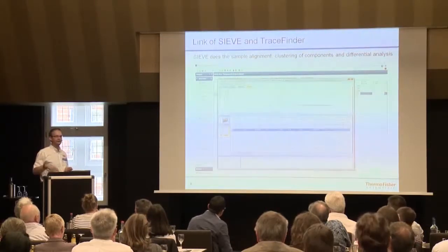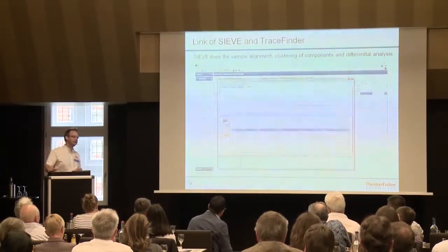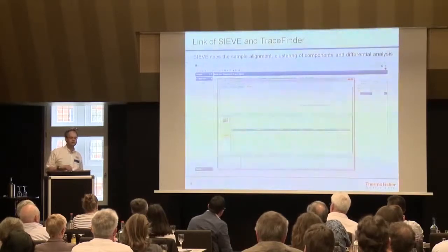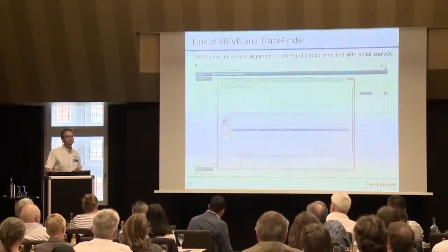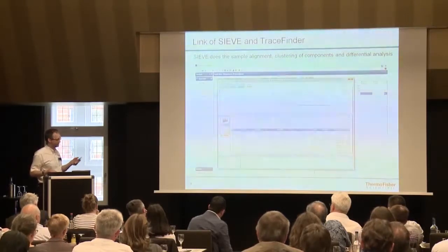That can be an internet search on a database like ChemSpider. It can be just take a database which is offline on the computer, which you call dblookup. And this can contain as many components as you want. In this case, I just ran the same 2,900 components I used in the first example as well. And so this is what you come up with.